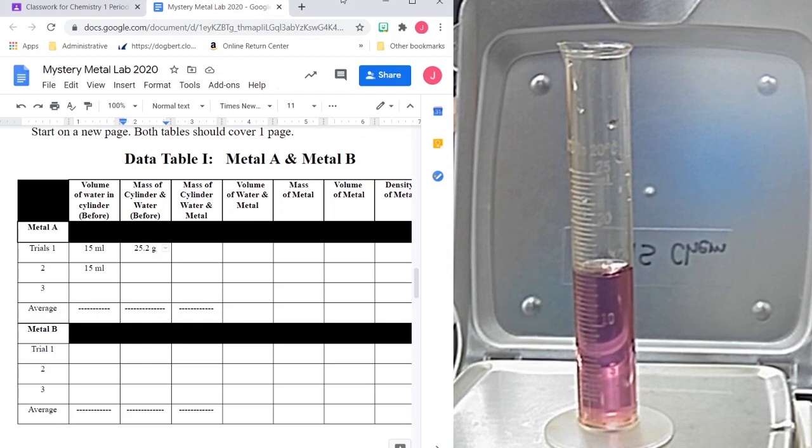One little thing about how to read these. This is a graduated cylinder, and each line represents something. You can see here that it says 15. Right here is 15 where the water is at. And the top one just above it is 20. If I count the lines in between, I count 10 lines. So I know I'm going 5 milliliters in 10 lines. I will do 5 divided by 10 to know that each line within there is 0.5 milliliters. So when I'm reading it, I can see. I'll show you in a little bit. I'll take down the lab sheet after our first one so you can see how I read it.